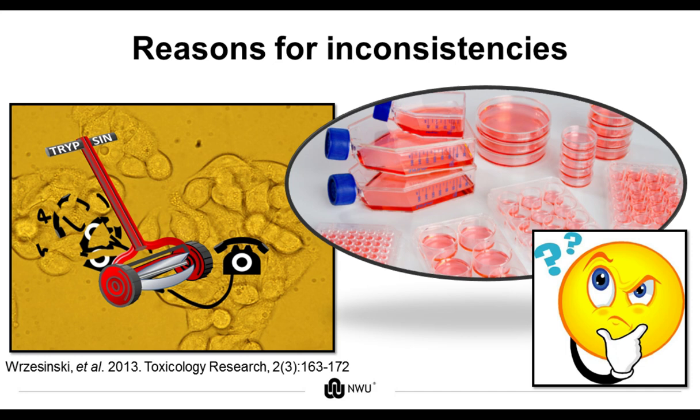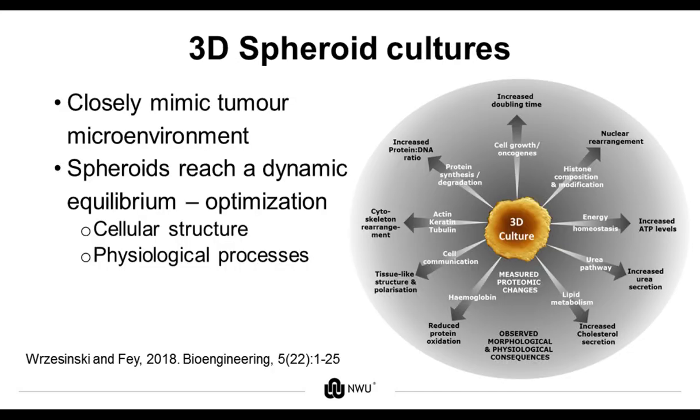These inconsistencies may be related to the fact that cancer cells cultured in 2D allocate more of their resources into continuous cell proliferation than into important functional pathways. Also, 2D cell cultures require artificial attachment surfaces for propagation and constant subculturing for adequate nutrient and growth space. This leads to concerns regarding the reliability and credibility of 2D in vitro models as accurate screening tools representative of in vivo cancer tissues.